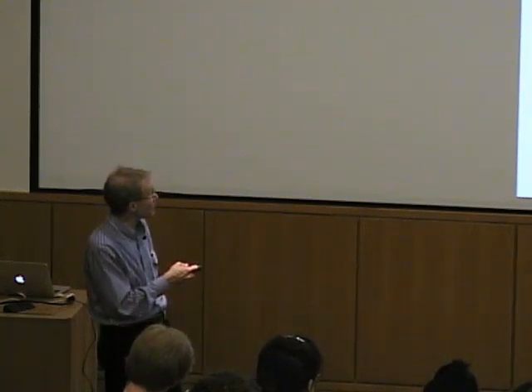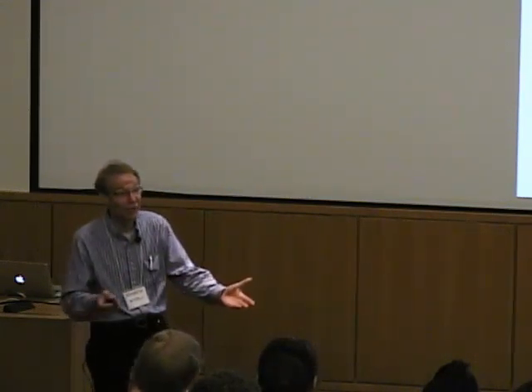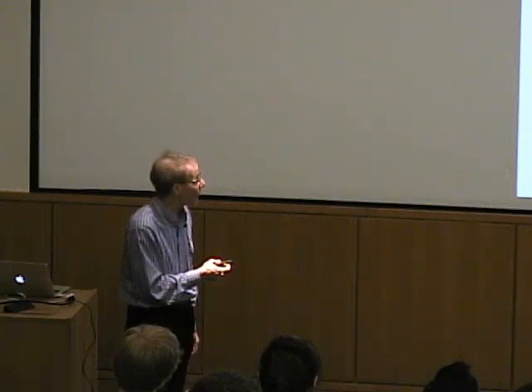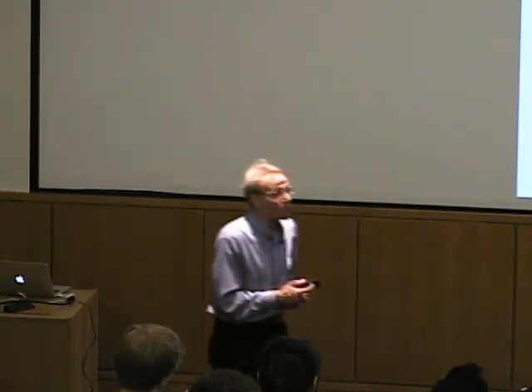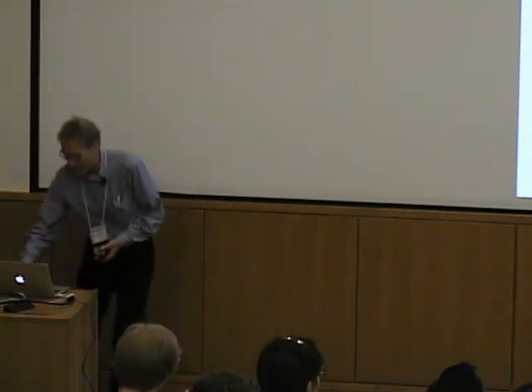So we can summarize. We can say the coordination site enthalpically is not very favorable for copper-2, but entropically binding is very favorable. We're going to desolvate the copper ion. We're displacing protons, and there's little rearrangement, so no penalty for that. So interesting. Not maybe what we might have expected with copper-2 binding to azurin.